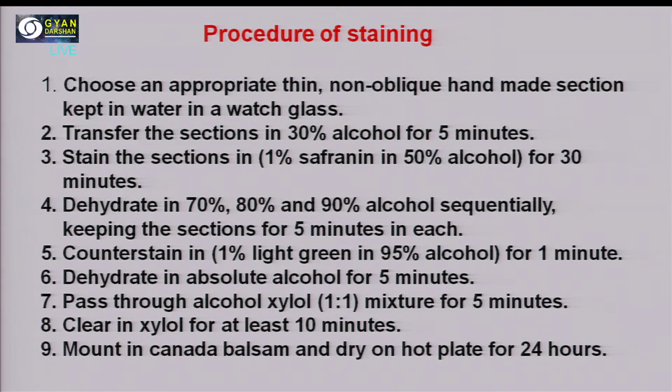Each of these treatments should be for 5 minutes. Next, you add the counter stain. The counter stain in this case is 1% light green in 95% alcohol. So, you counter stain it with light green for 1 minute. Mind that these time limits need to be adjusted.